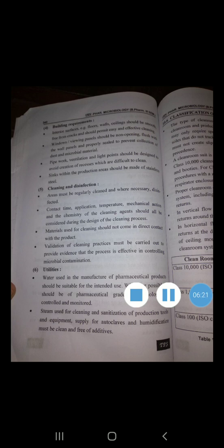Proper clean room design encompasses the entire air distribution system, including provisions for adequate downstream air returns.